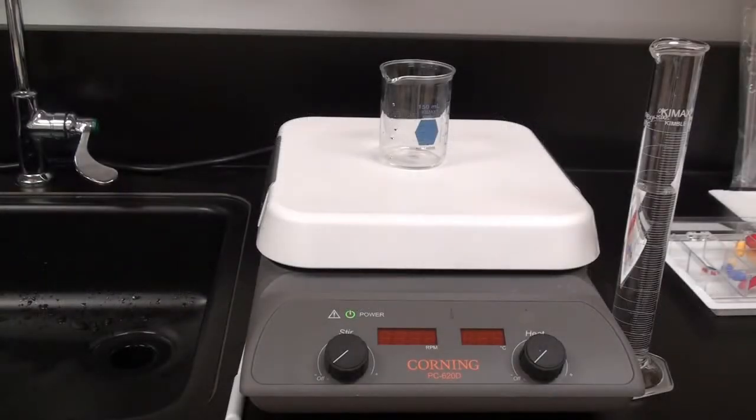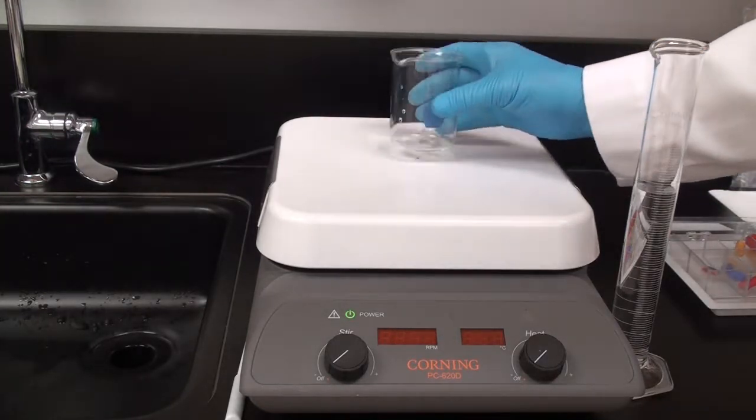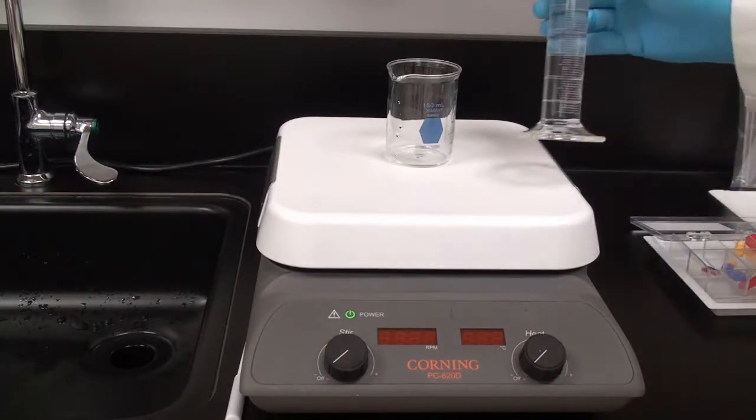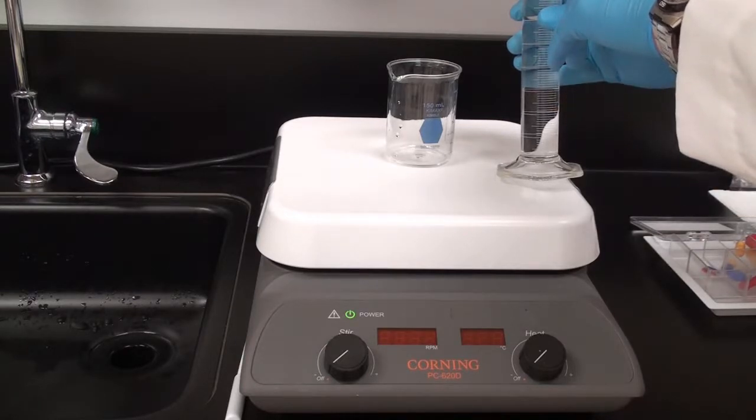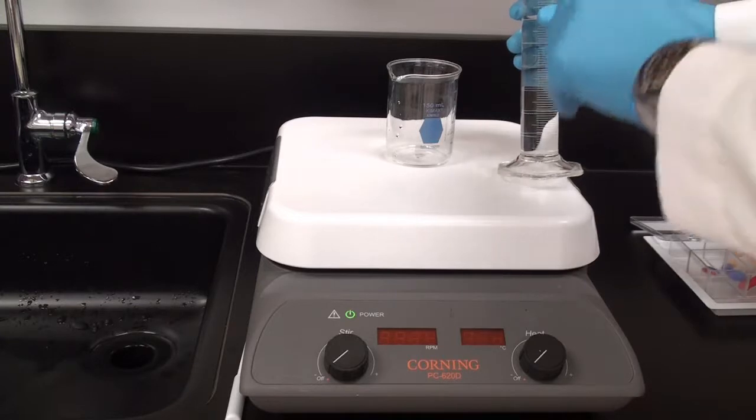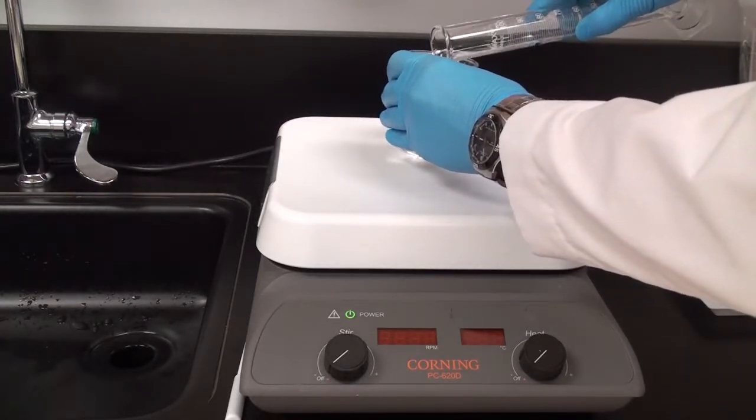The first thing I'm going to do is heat up some water to 60 degrees. I'm measuring 75 milliliters and I'm going to pour it into here and warm that up, mix the solution totally, and then QS it to 100 milliliters when I'm done.